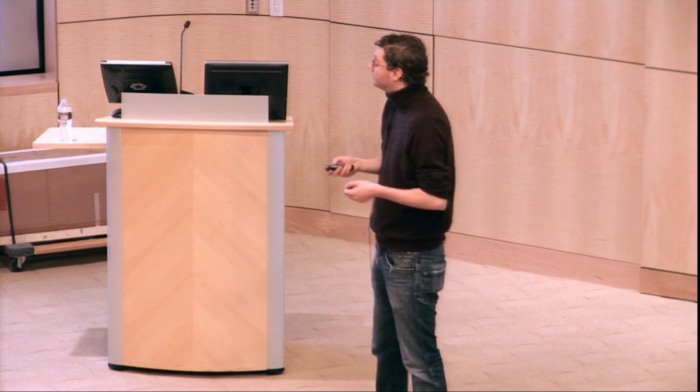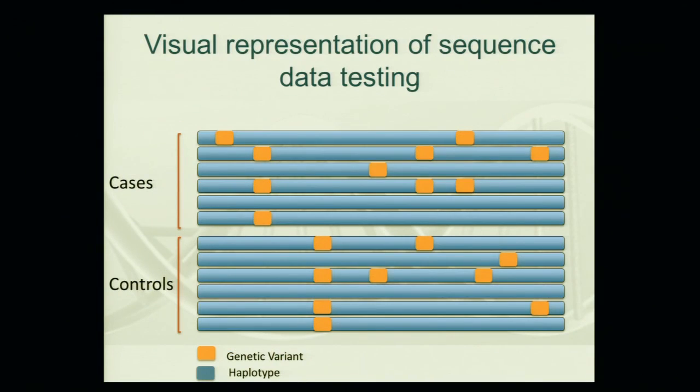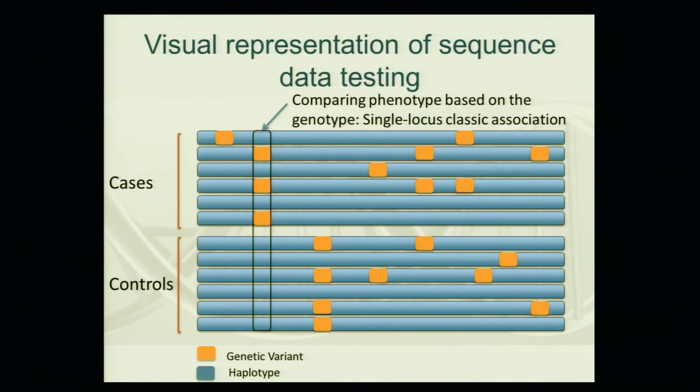All of these things mean different things at different times because they keep updating in terms of what we understand about the error processes and modeling the different sequencing technologies. So it's difficult to give you a clear idea of exactly what is going on right now because it really won't persist. But you can go and peruse GATK and Picard and so forth. Oh, that's interesting. What's that doing here? Anyway.